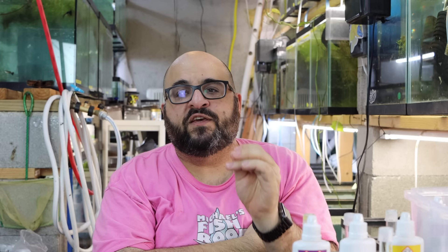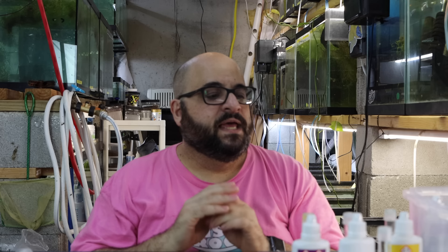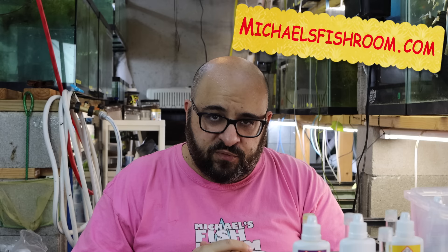Looking at the nitrate test — it's a deep orange. Comparing to the card, I'm going to say it's about 10 parts per million. So my water results: pH 7, ammonia zero, nitrite zero, nitrate 10 parts per million — that's fine, it's perfect. If you ever go on Facebook asking for help, try to state your parameters in the right order: pH, ammonia, nitrite, nitrate, and then KH and GH if you have them — but that'll be another video.